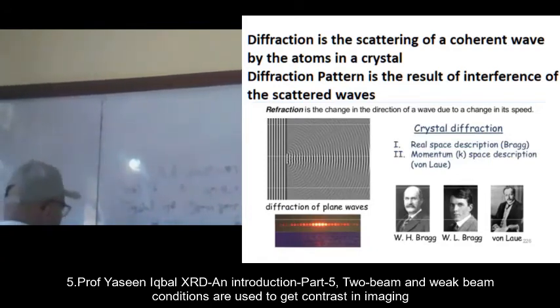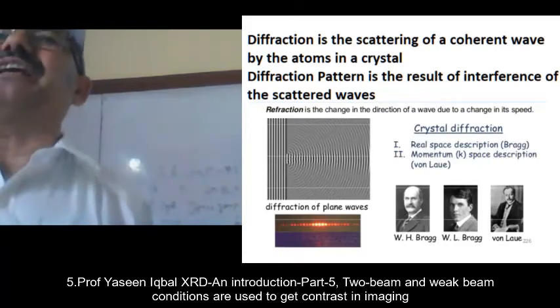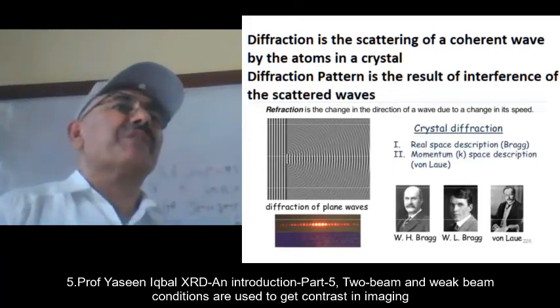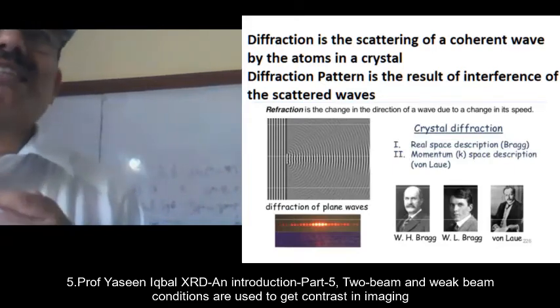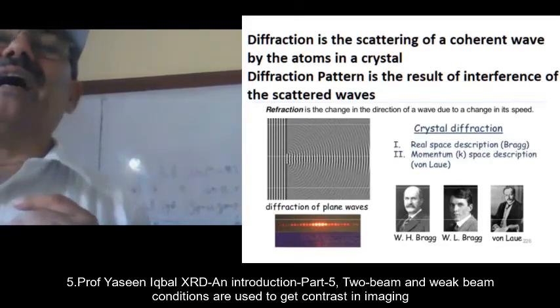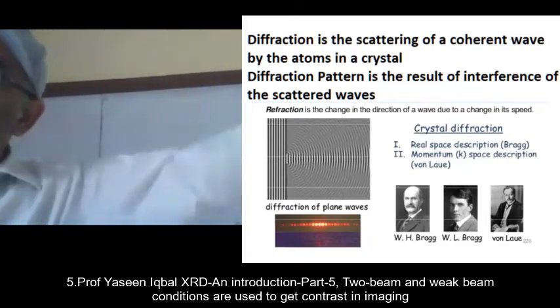If a shower is coming like that of electron beams, then there will be diffraction everywhere, and the diffraction events will be so many that it will become very difficult for you to resolve them. That is why in X-ray, people use small slits. The drawback of a small slit is that it decreases the intensity of your pattern.